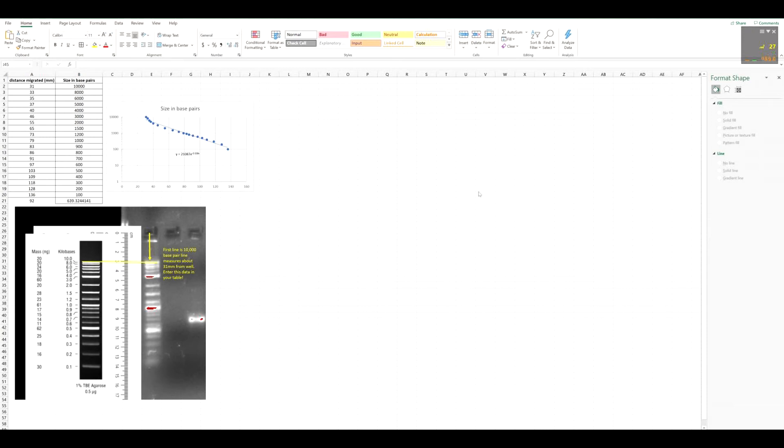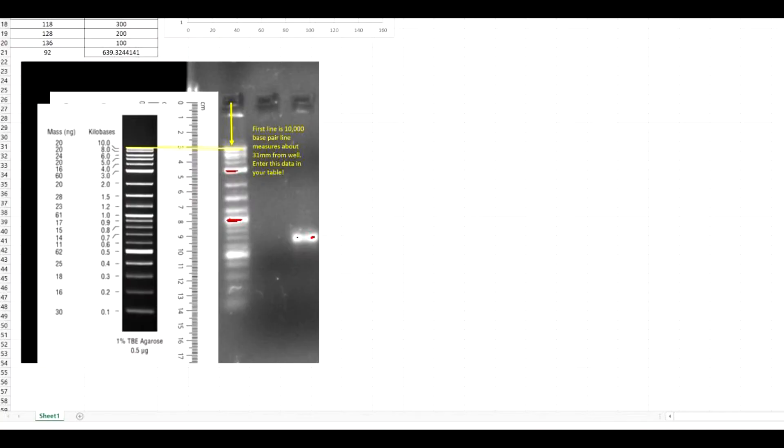This video is for those of you that are struggling with making and understanding standard curves. I already did one here based on your guys' PCR gel.